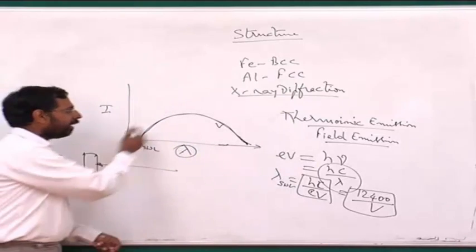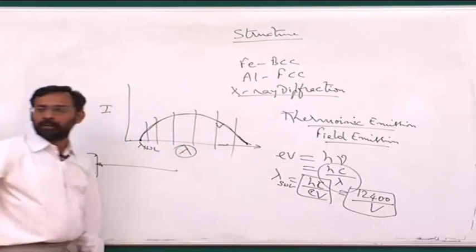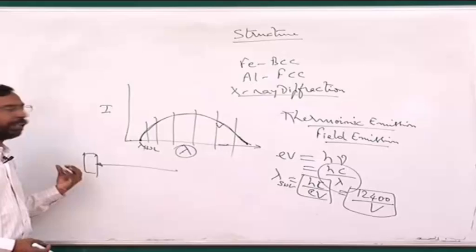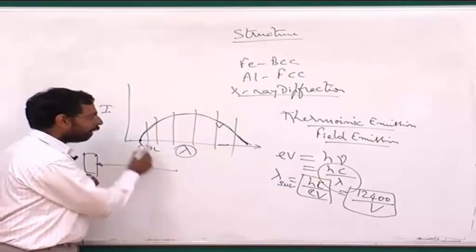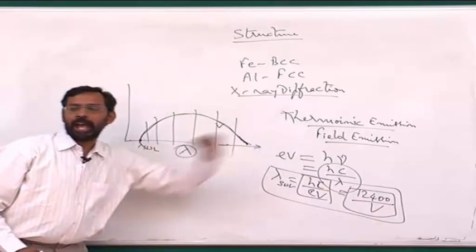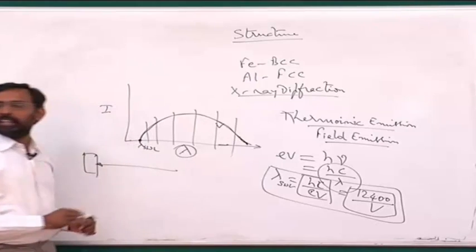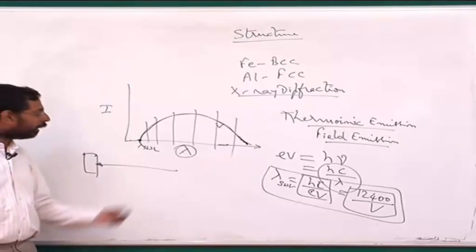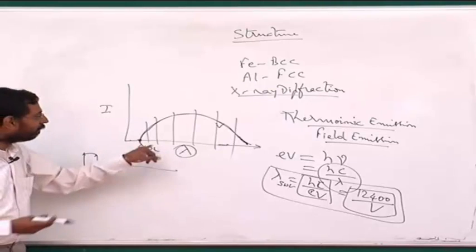Okay, so the X-rays that are coming out will have varied wavelengths. These are all the wavelengths of the X-rays coming out. Depending on how many collisions the electron is losing its energy, you will generate a variety of wavelengths. Out of them, the smallest will be the one which satisfies this condition. And of course, you will have a lot of them, and the probability of having this is very small, and that's why the intensity of that is very small. The probability that the electron loses all its energy in one single collision is very, very remote. And as a result, you will see this.